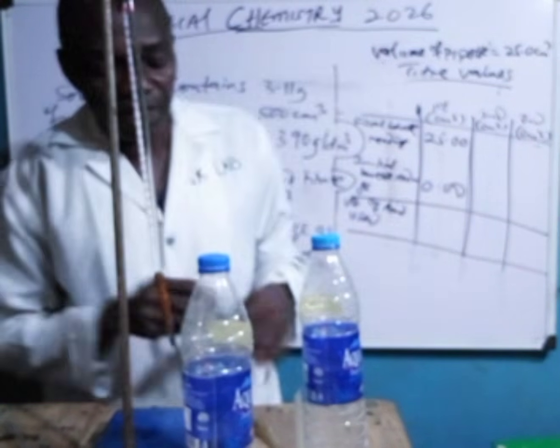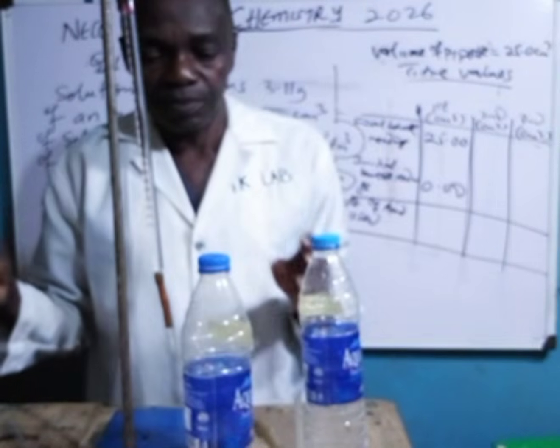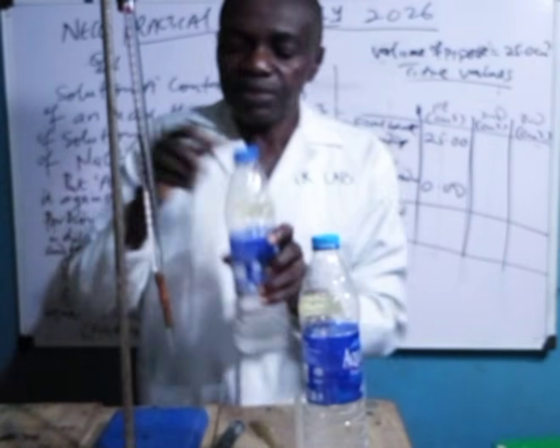Then we'll fill it again and do the second one. This is our acid.